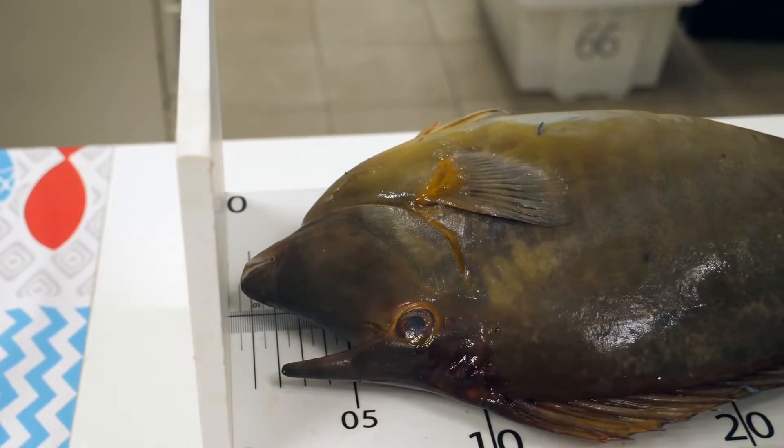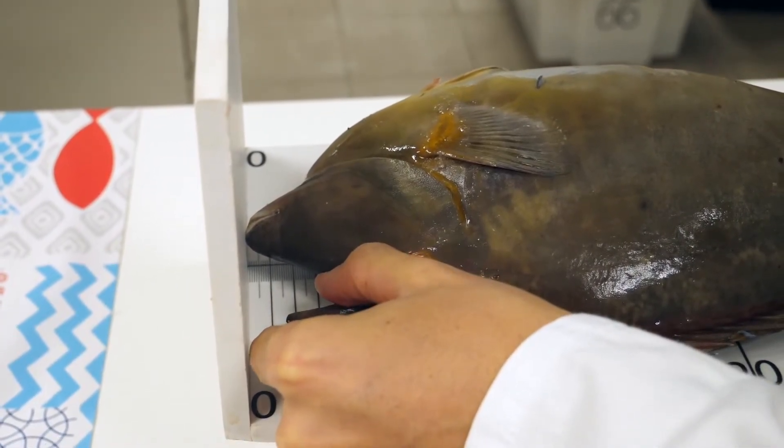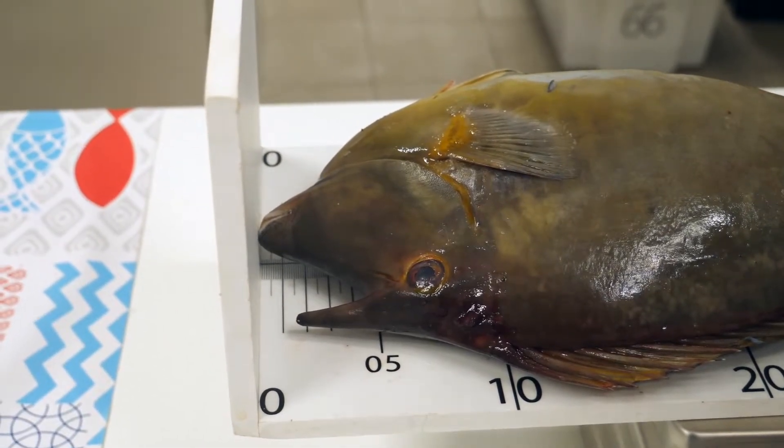Some fish in the unicorn fish family have a horn. In this case, do not use it for measurement. Instead, align the mouth with the zero.